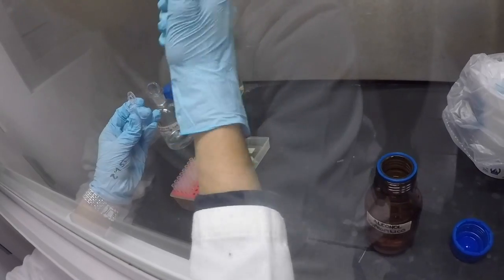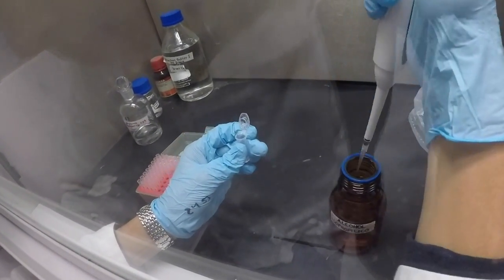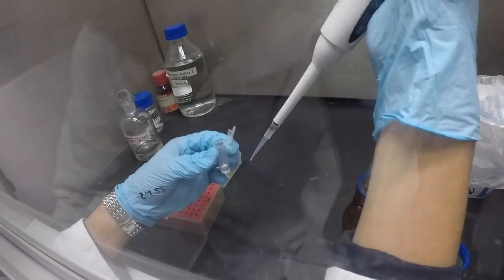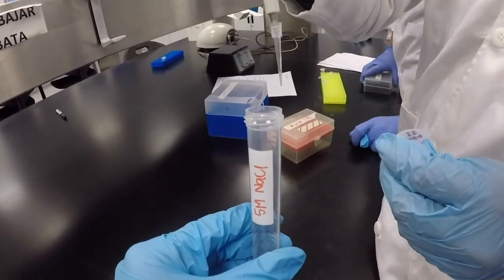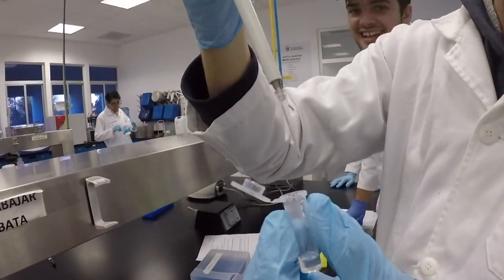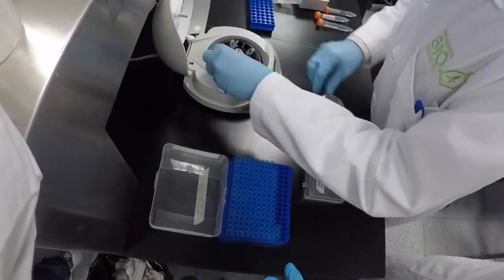Continuing again in the laminar flow hood, the same volume of isopropanol was added to the microtube as the recovered volume of the supernatant, consisting of 300 microliters. Also, 10 microliters of 5 molar sodium chloride were added to the microtube and mixed gently by inversion.